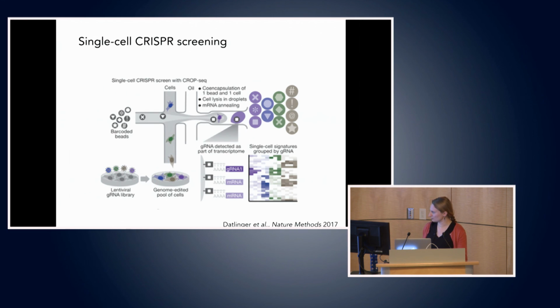Furthermore, there's been a very recent paper that came out in Nature Methods that combined Drop-seq, which has also been done here at the Broad, with CRISPR screening. So you can now do single-cell CRISPR screening. And so this is a new and powerful technique that may be of interest.